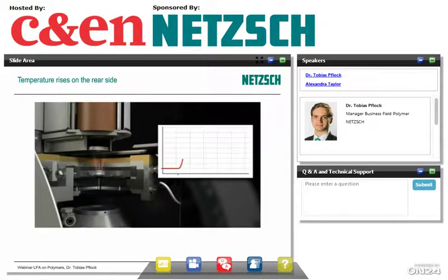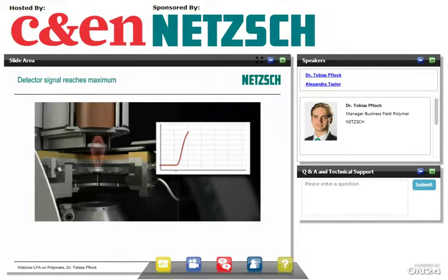What happens next is some of the heat now starts to travel through the sample, depending on the transport property of my sample, and our detector starts to see some signals. So our temperature at the detector, or the signal at the detector, is increasing. And this will continue until I reach a maximum of heat transport through the sample.